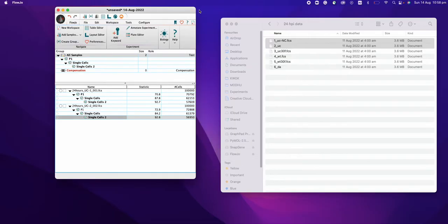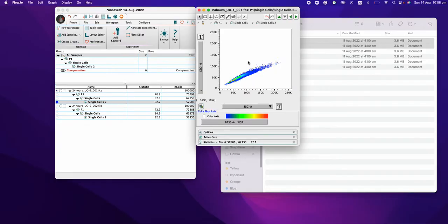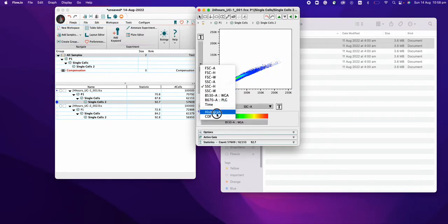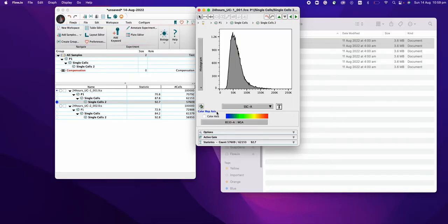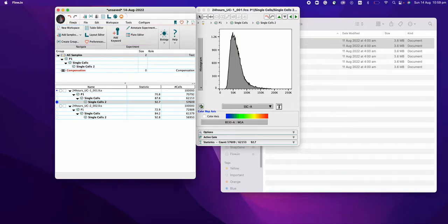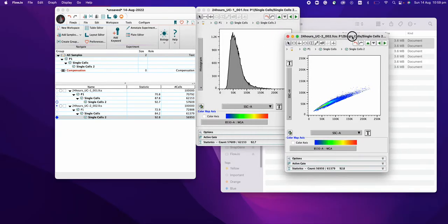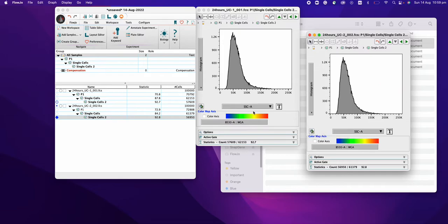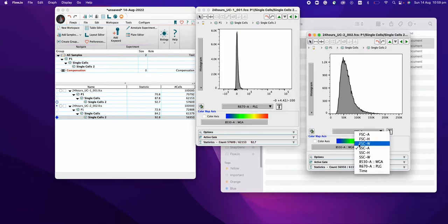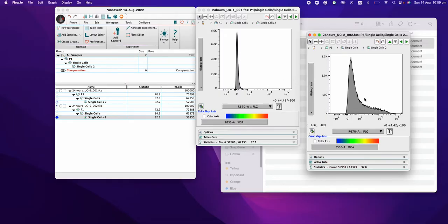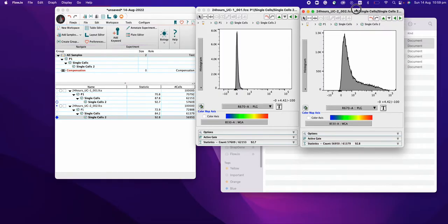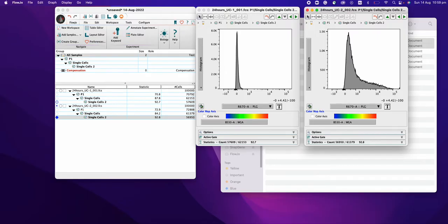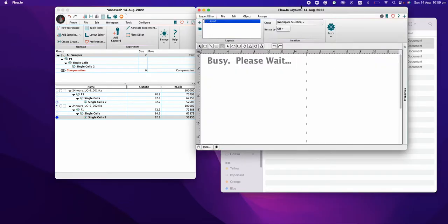Now I will introduce the analysis here — open this part and then check the histogram as well, and opening this part too. I will check the histogram. I'll select what I'm looking for — this one, same to this. It's definitely very high because it's the negative one. So I will create a layout.